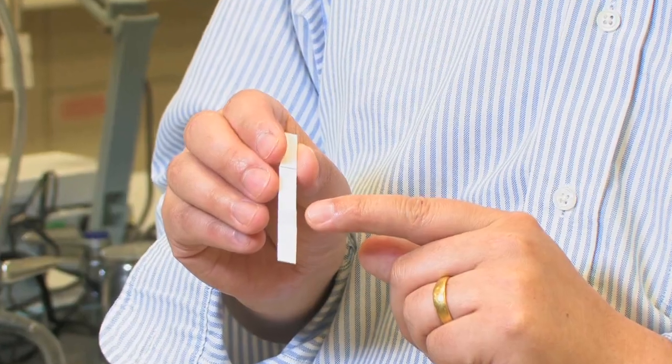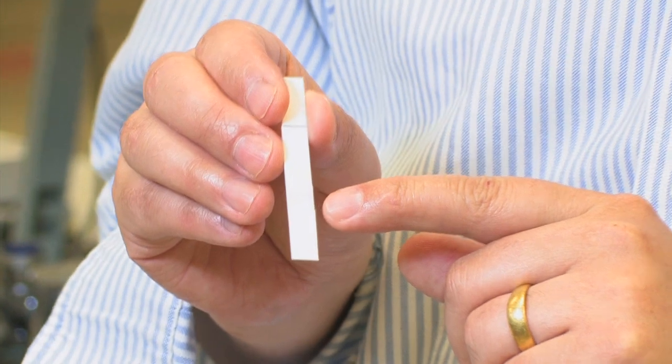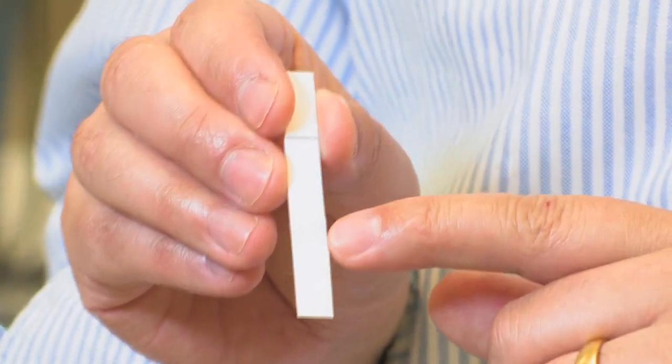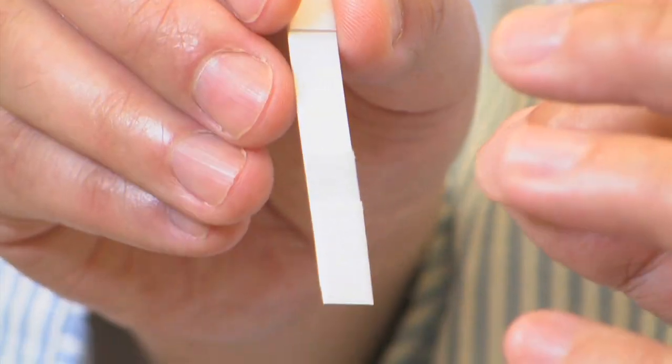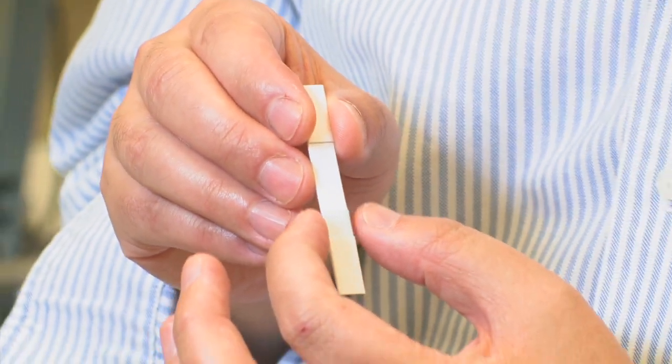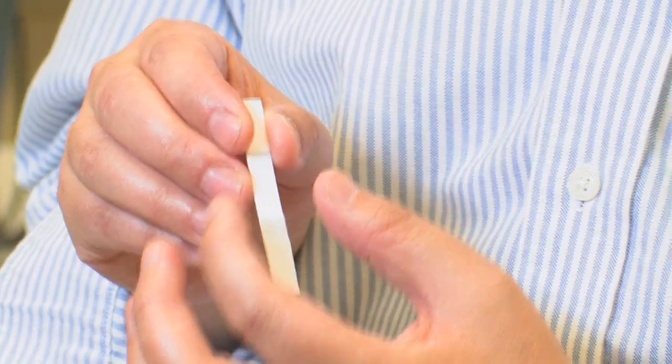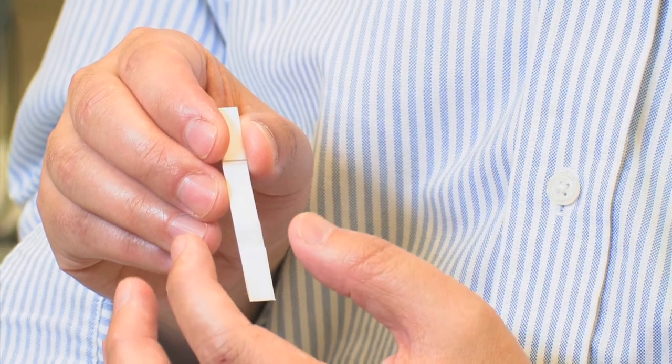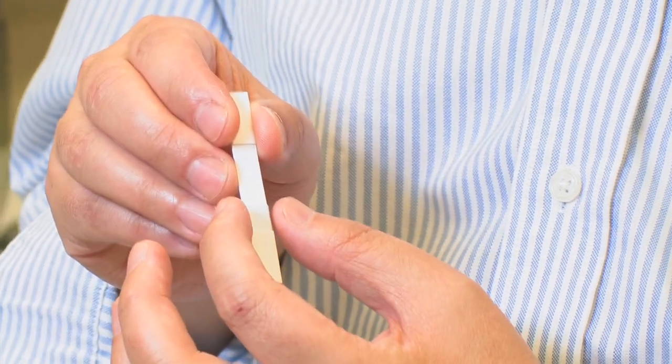So what we have done here, although it's colorless right now, we placed the DNA with gold particle right here. You dip this into a solution. If there is no such target, this DNA gold nanoparticle will not have any reaction. There is no change of color and it stays in this particular place.